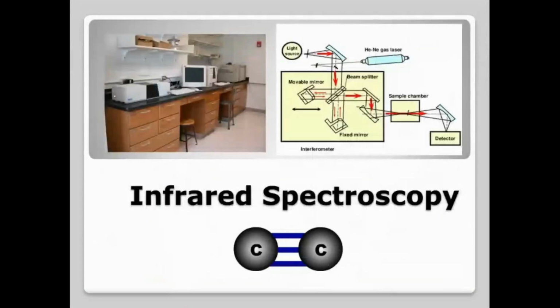So IR spectroscopy generally deals with what happens when IR radiation falls onto the molecule. The bonds are already vibrating. The molecule has many different types of bonds, and all the bonds are vibrating. When I give the IR radiation, the energy specific to a particular bond vibration will be absorbed, and that can be studied using IR spectroscopy.